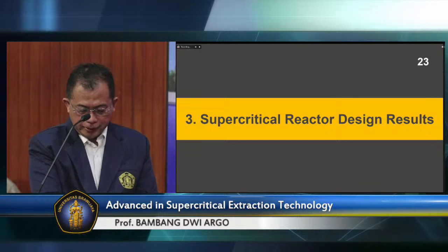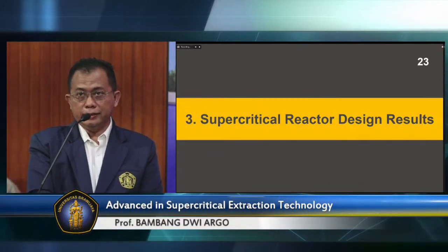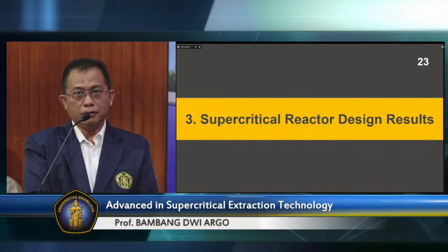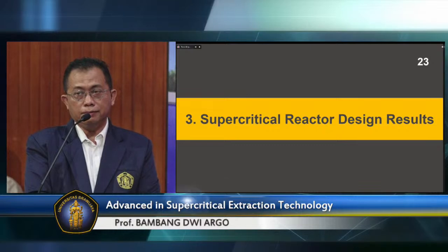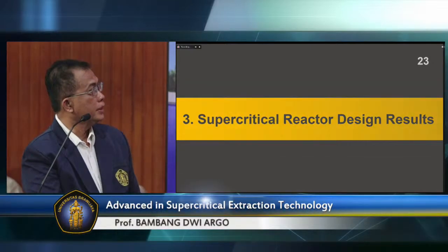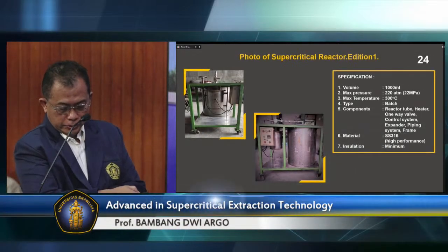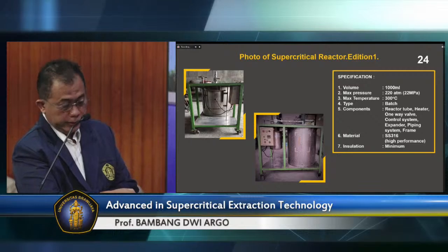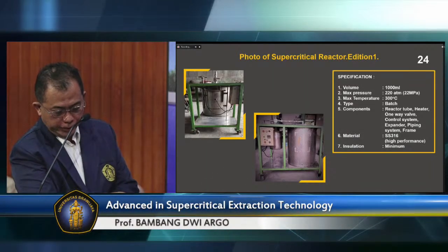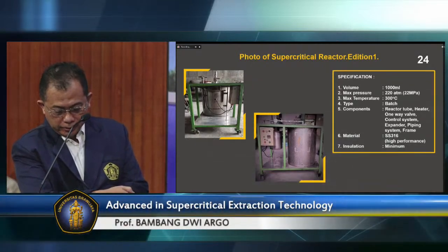Next, I will present our experience of designing, building, and testing supercritical method for production of biodiesel. I will show the research experience in the designing, manufacturing, and testing of batch type supercritical reactor for production of biodiesel.